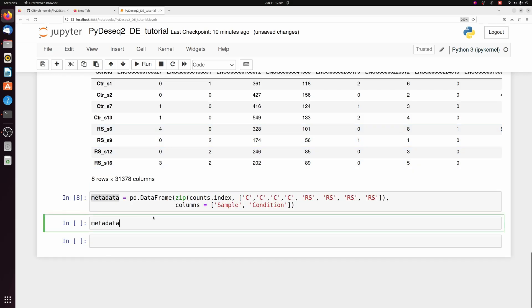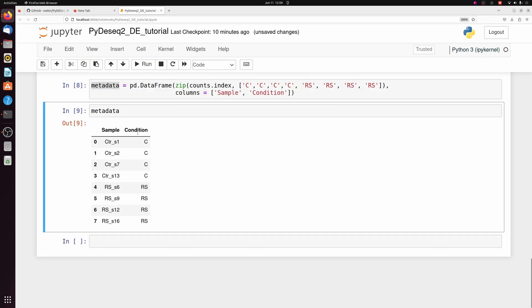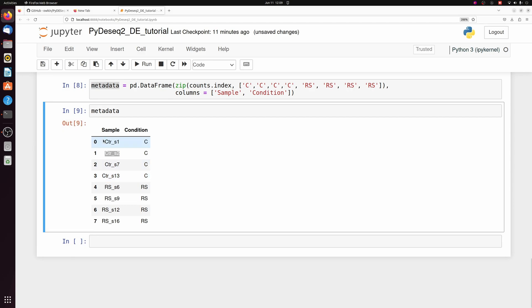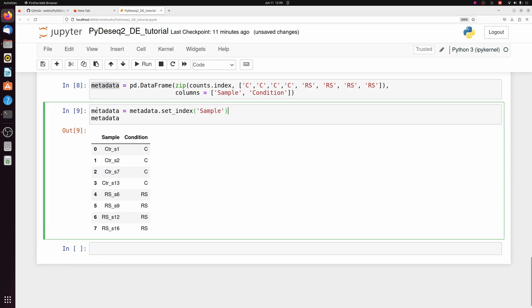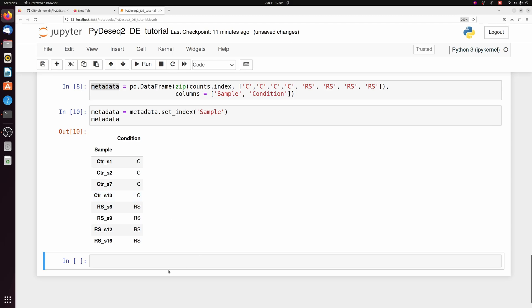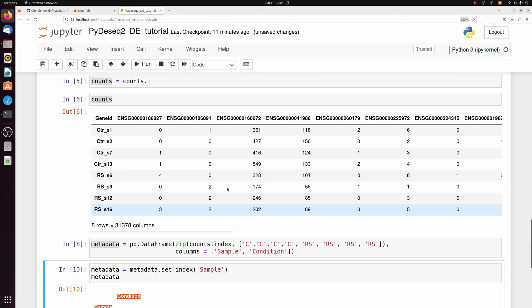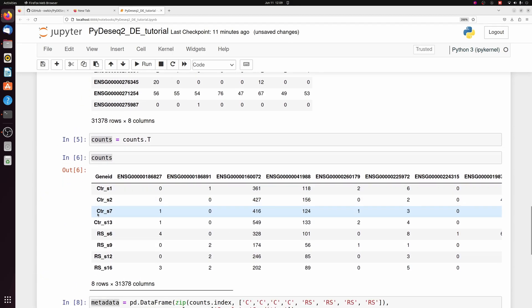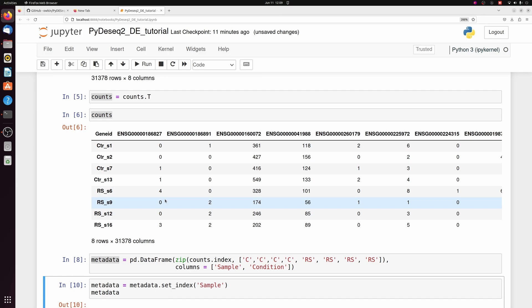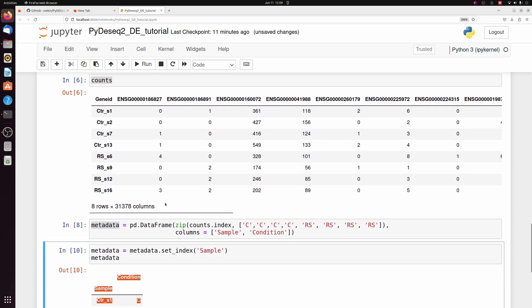So we just have this simple data frame. I'm just going to call this metadata. If you had a batch or other variables, you could just add more columns here. But anyway, we need to set the sample column as the index, just like we did for the counts. So now our sample table is ready. So we have our sample metadata, and we have our counts table. We can now do differential expression.